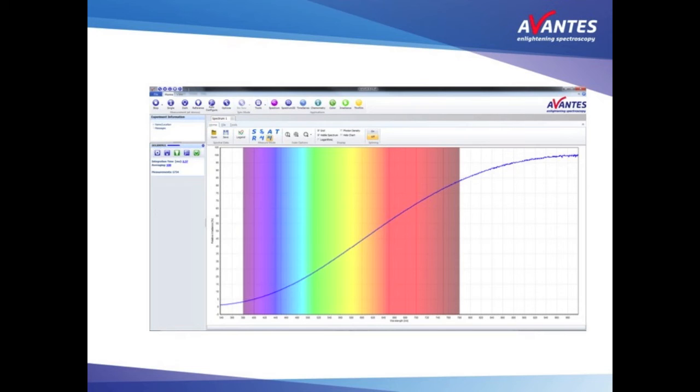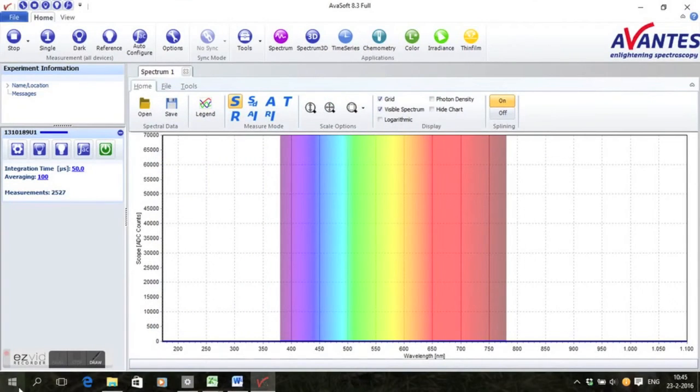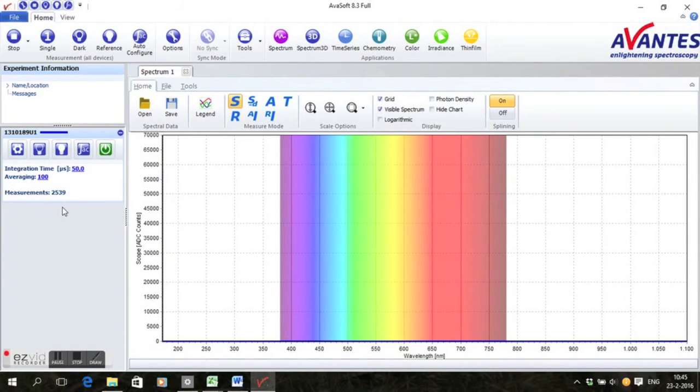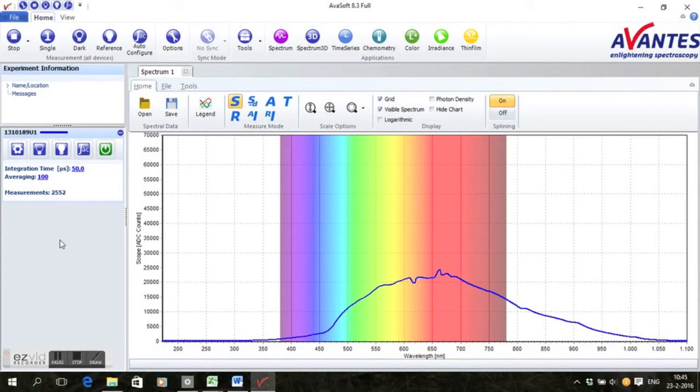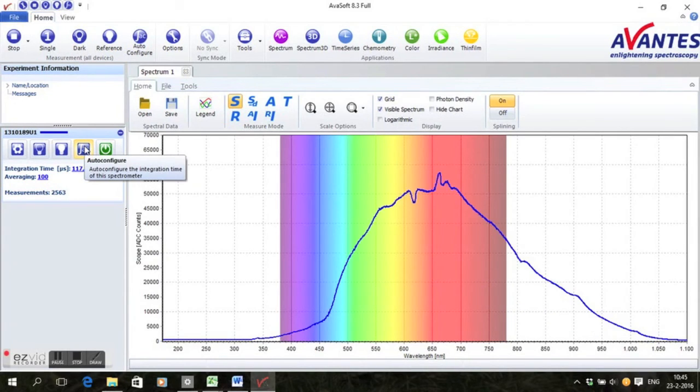In this mode, one can intensity calibrate a spectrometer system the following way. Have your system look at a halogen light source, preferably with a color temperature of 2850 Kelvin for accurate results.